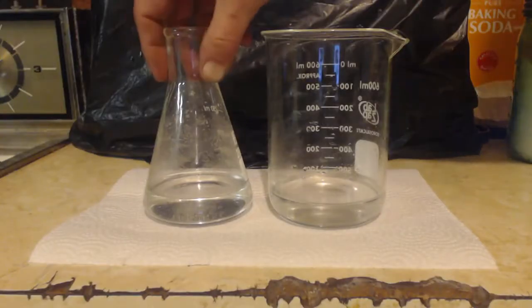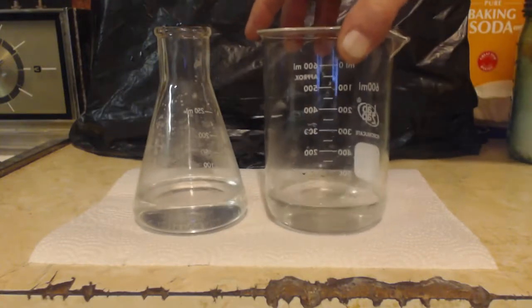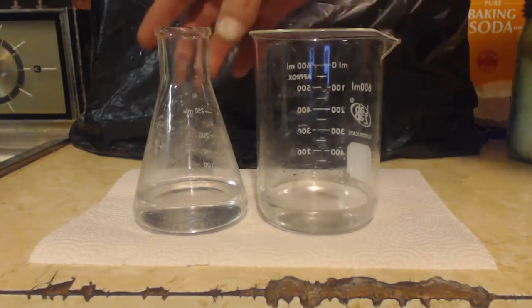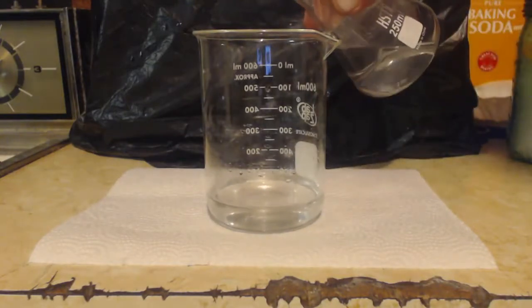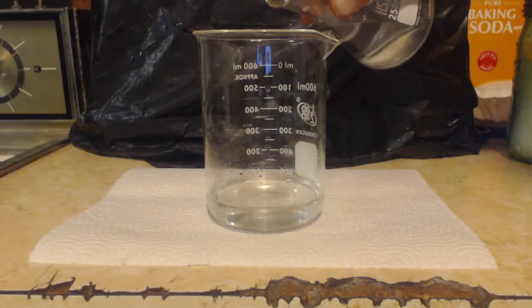Alright, I got ammonium sulfate ions in here. I got calcium and chloride ions in here, right? All soluble. But when I pour these sulfate ions into the calcium ions, they're going to touch each other, and when they do, they're not soluble. Let's get maybe a little closer. Look.